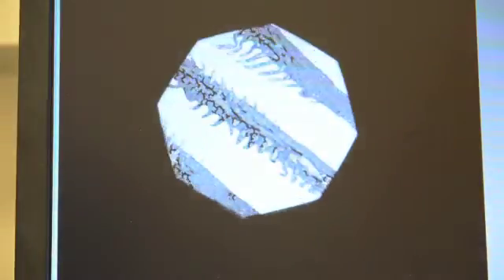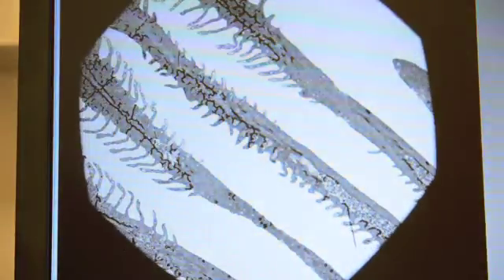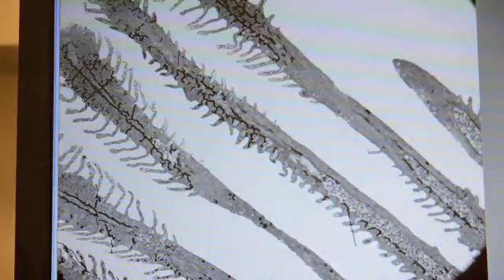Now open the field iris diaphragm so that it just fills the field of view. Now we need to adjust the condenser iris diaphragm.